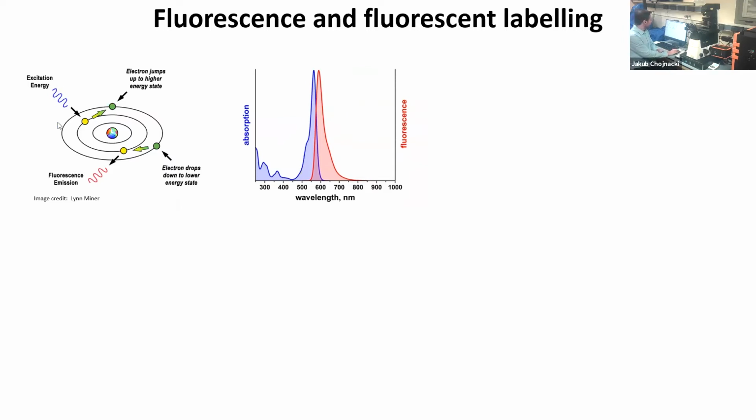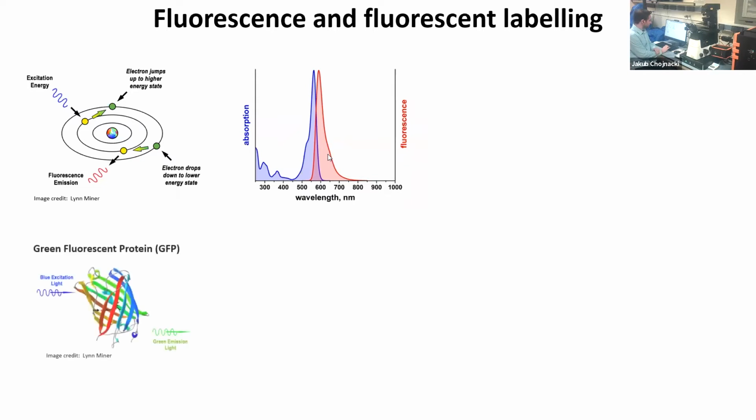So when the electron is excited with the blue light, it tends to emit higher wavelength orange light. This is because blue light is generally more energetic, and the red light has a little bit less energy, and that is exactly why this event is called Stokes shift. This is why fluorescent molecules always fluoresce a little bit towards the orange or red part of the visible spectrum. And this is visible by the higher wavelengths of the emitted photons compared to absorbed photons.